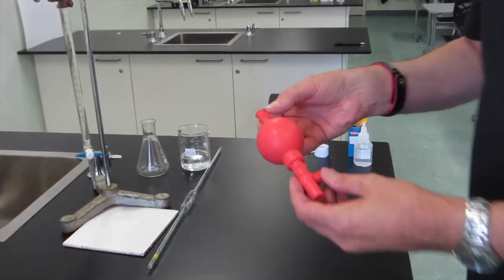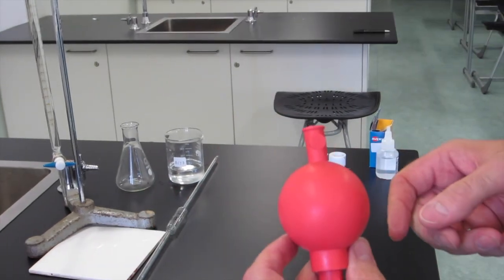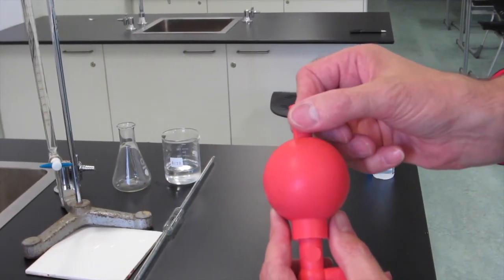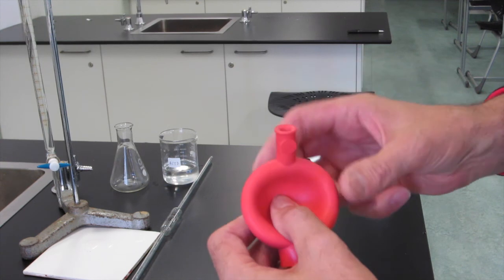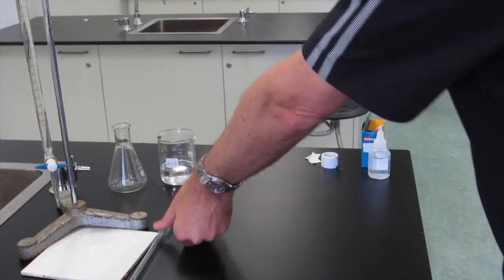Now we're going to look at how to use a pipette filler. There are several valves on the pipette filler, we're going to use the one at the top. You squeeze that and press in on the bulb and that evacuates the bulb and allows you to suck up solution.